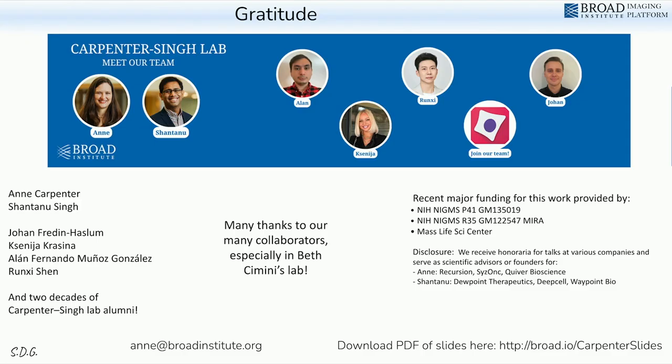That blog post talks you through some of it, from simple, if you're lucky, to hopeless if you're not lucky. So it takes you through that emotional spectrum. It includes things like, step one, if you've used CellProfiler for feature extraction, what are the names of the features, and do they group by channel? Do they group by stain? Is it all size and shape, or is it all texture of a certain channel? That's the simple end of the spectrum, and then it gets harder from there.